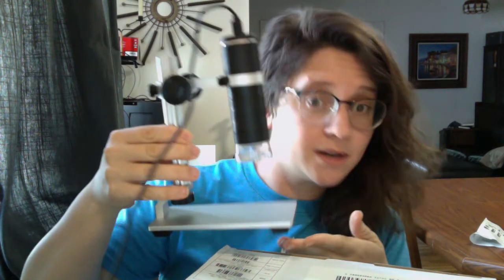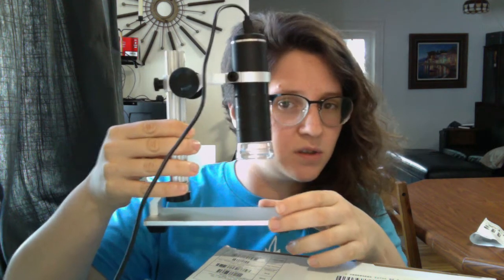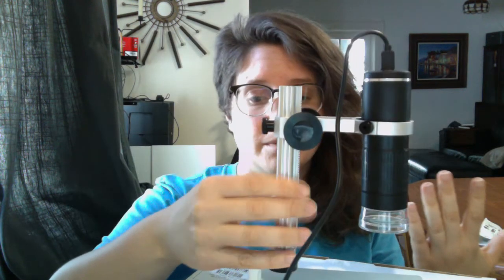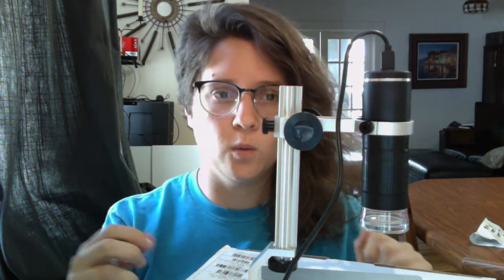It's a nice compact little microscope. You'll notice that the stage is relatively small, so you can't put a Petri dish on here and do some sorting unless you're careful to make sure that you don't bump it off. Maybe you can put a heavy bit of tile that's a little bit wider there.